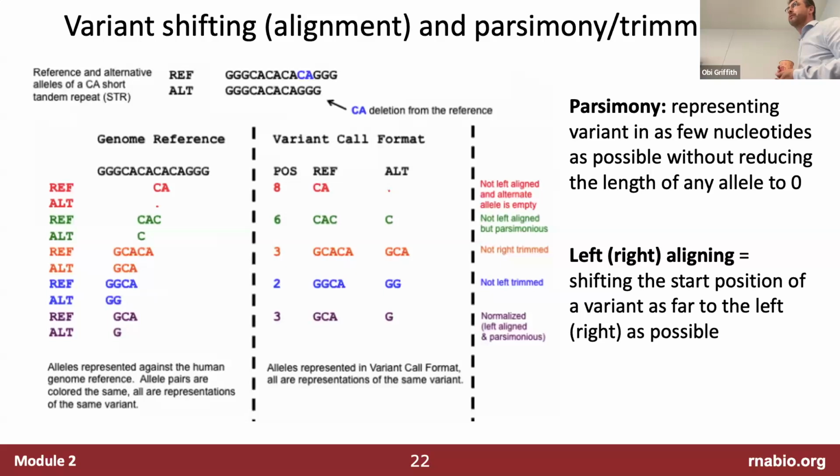Right, even though it's technically aligned. Well, it's equally left aligned with respect to the variant. It's just not as trimmed as the bottom solution. Okay, so they're both left aligned, but one is not as parsimonious as the other. Sure.